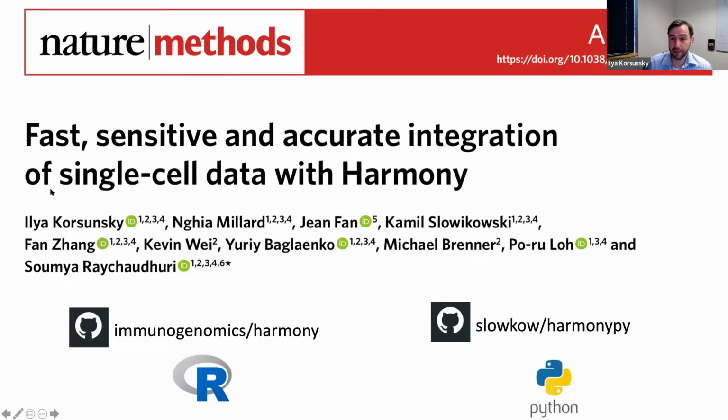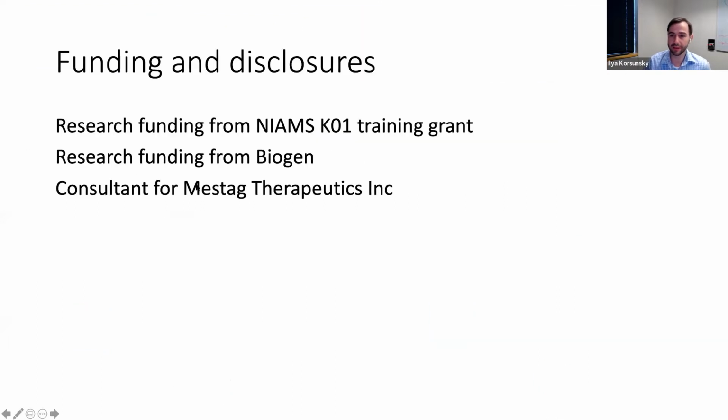So this is it. This is the paper. It was published in 2019, and it's available in R. Oh, sorry, I skipped ahead.